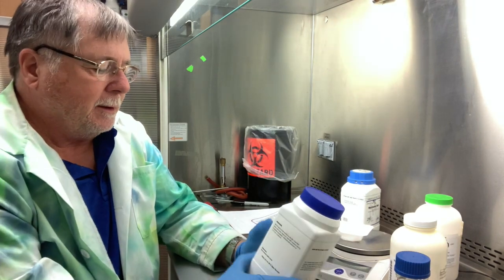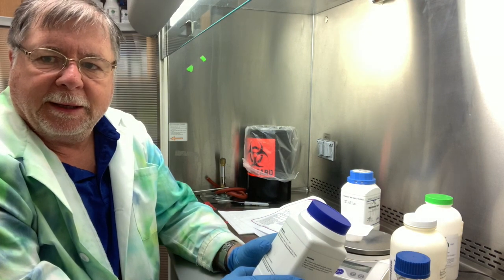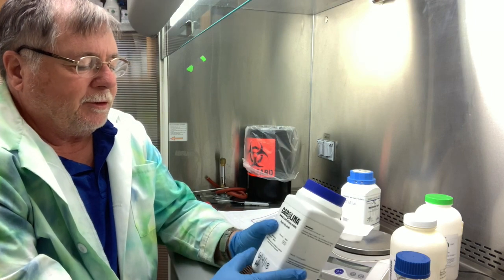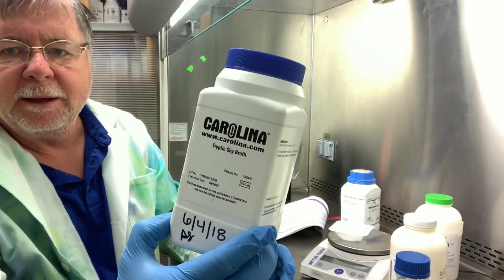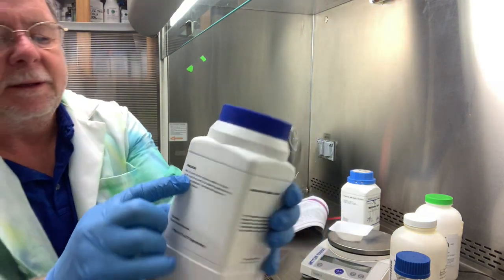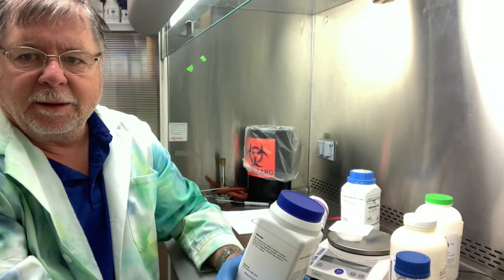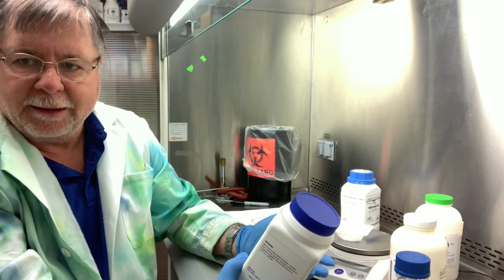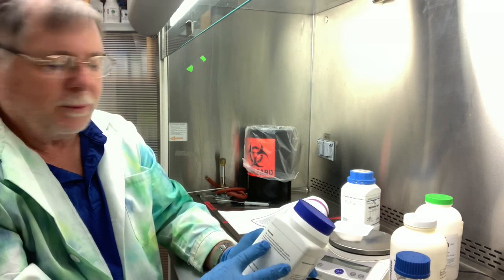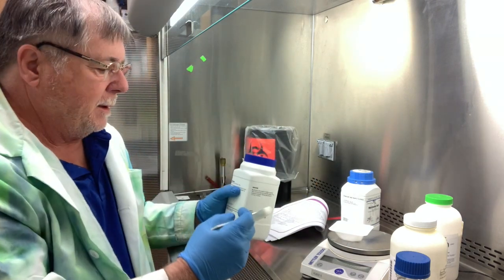Hi class, this is looking at the second part of our making the bacteria media. So what we're going to make up is a batch of tryptic soy broth. Tryptic soy broth requires 30 grams of media per liter. Well, we're going to make a tenth of that, or 0.1 liters, or 100 milliliters. So we need to take 30 grams and divide it by 10, and that'll give us 3 grams. And so we're going to make out 3 grams of this broth.